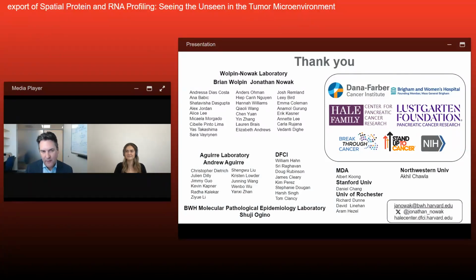And then I think the final point I would just make is that you really want to choose the best assay for the job. Every technology has limitations, whether it's plexing, resolution, sensitivity, throughput, or cost. All assays compromise somewhere, and there's not one single best choice for profiling either human or mouse tissue. It's really a decision that you need to make in the context of the specimens you have and the biological question that you're trying to answer. Certainly lots of exciting choices out there. The field is changing very quickly, which makes it exciting for us, but it's still important to have that degree of levity and pragmatism.